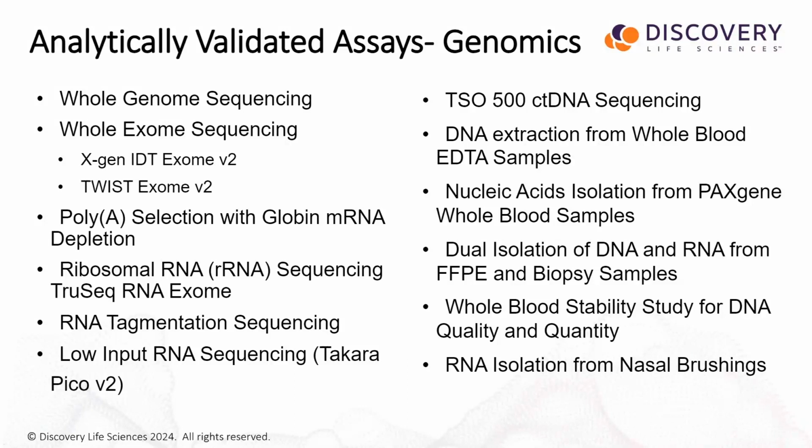Apart from that, DNA extraction from whole blood using EDTA samples or PAXgene, dual isolation of DNA and RNA from FFPE and biopsy samples, whole blood stability study, as well as RNA isolation for the nasal brushing samples.